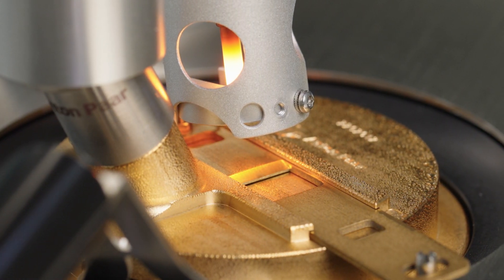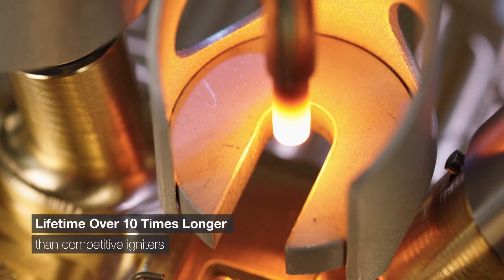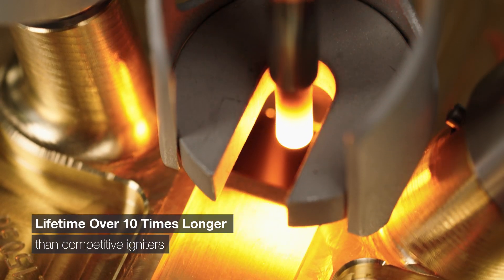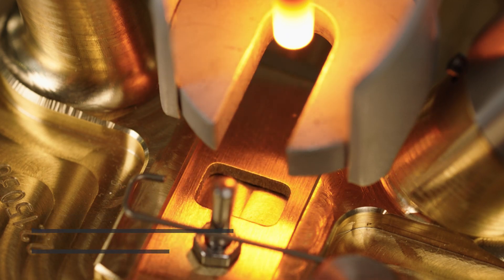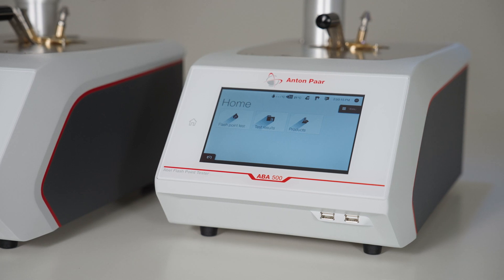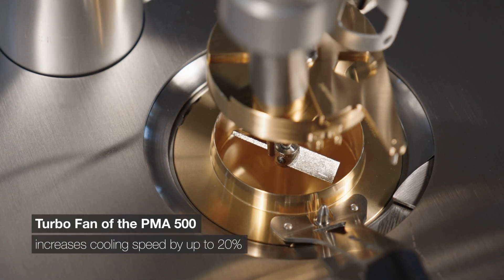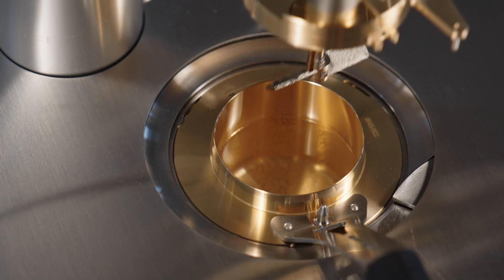They're built to last. The patented ceramic-coated electric igniter systems of our new generation instruments have a lifetime 10 times longer than that of the competition. The two-in-one cooling system in the ABA 500 and TOG 500 and the turbofan of the PMA 500 are built to extend your measurement's temperature range and increase your sample throughput.